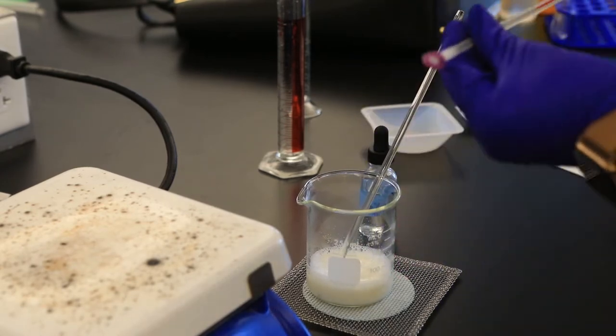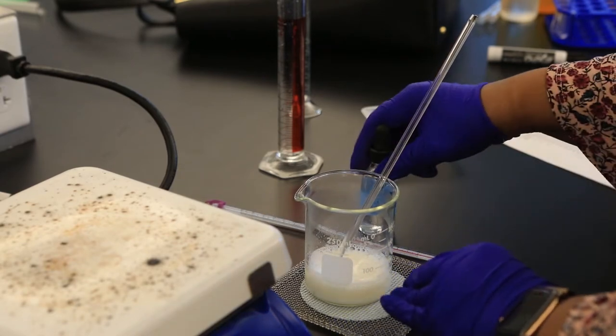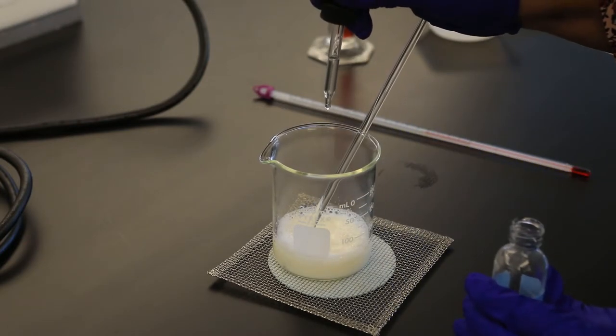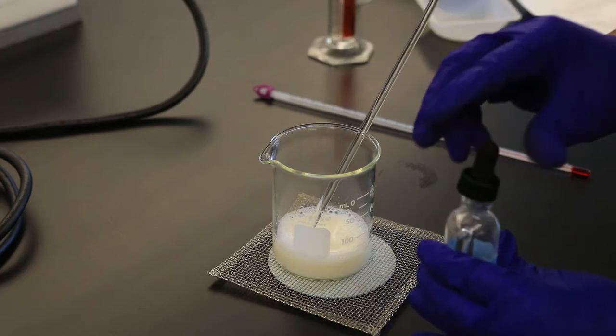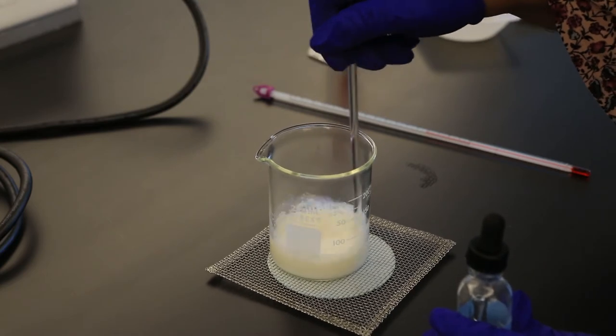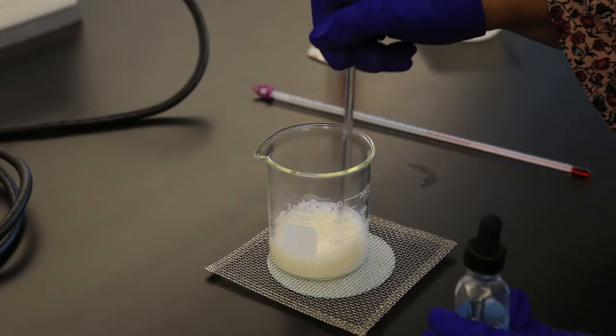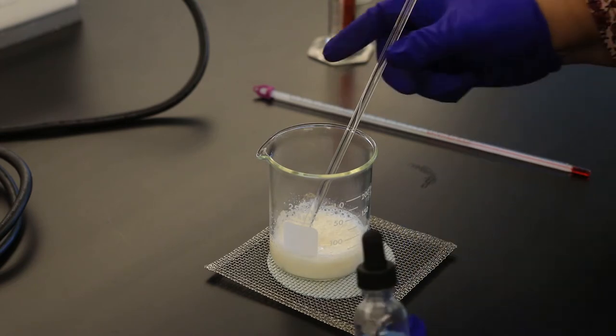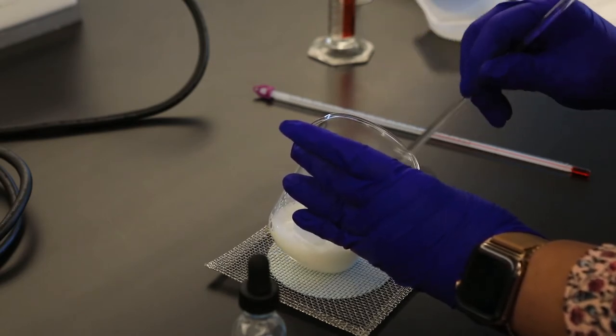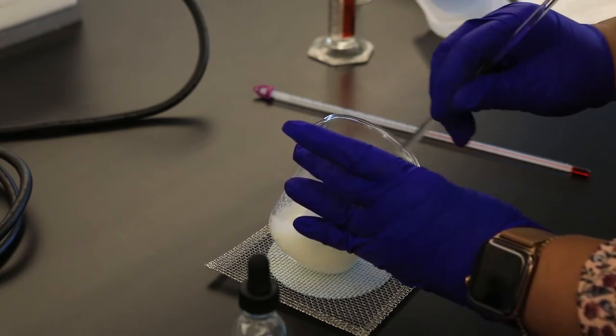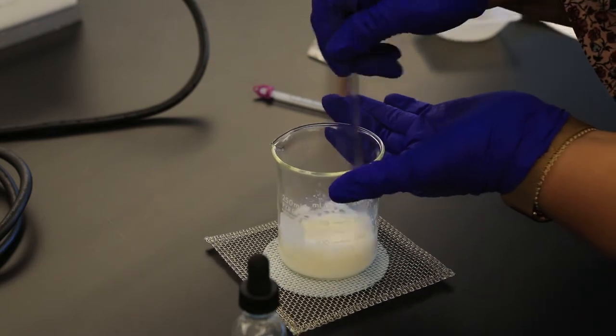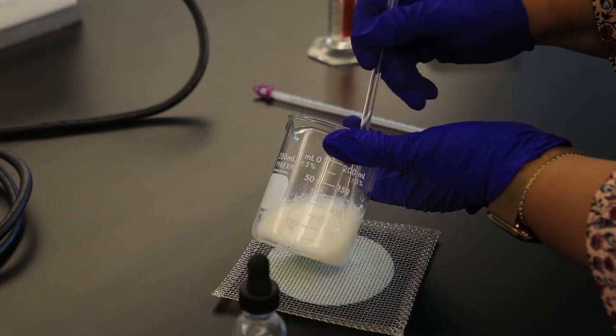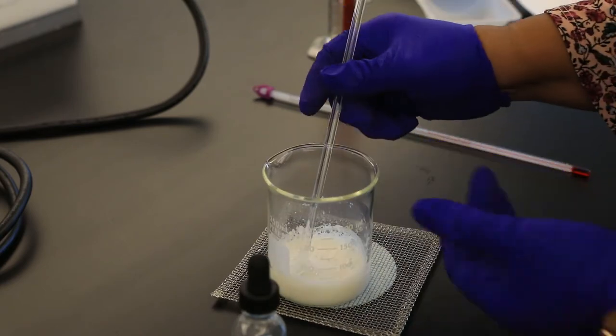I'm going to remove our thermometer and start adding the acetic acid drop-wise, no more than about 5 drops or so each time. I'll stir and allow the solid to form. The solid that is forming is actually casein. We don't want to add too much acetic acid, so as soon as no additional solid is forming, I'll stop adding the acetic acid.